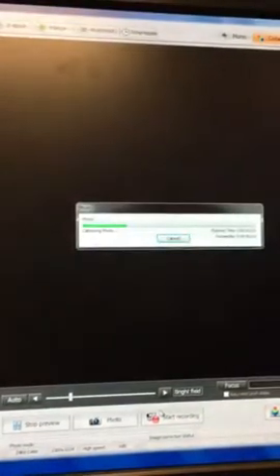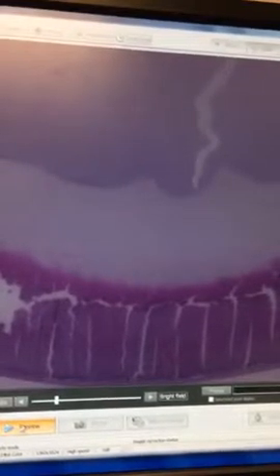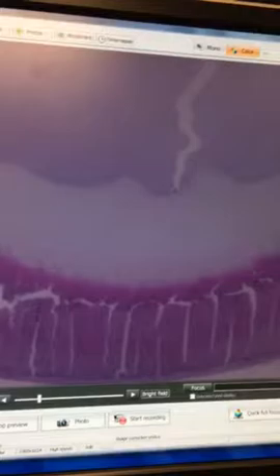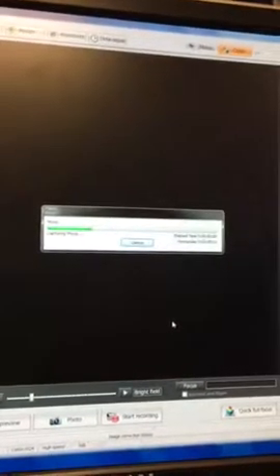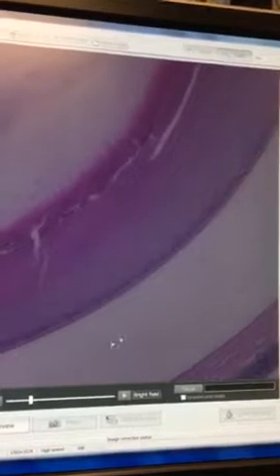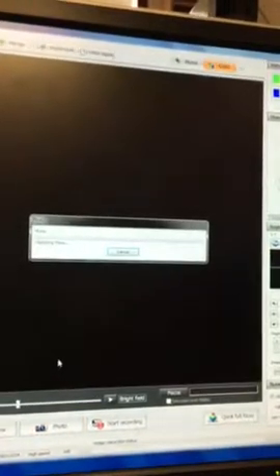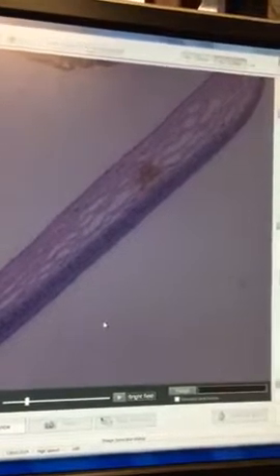Take a photo. Again, toggle back to preview, move it over, take another photo, toggle back to preview, move it over, take one last photo. That'll get you a nice rectangle of merged 20x images.